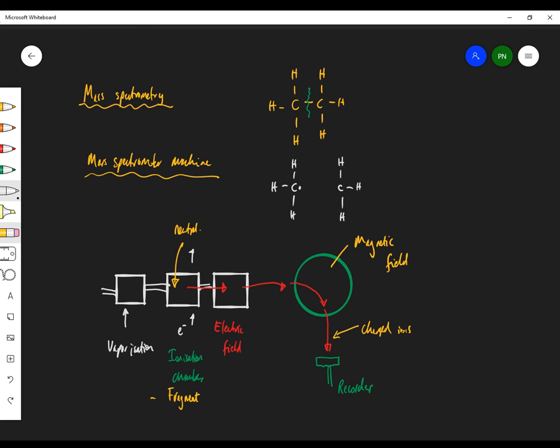Let's pretend there's an electron there and an electron there. So there's two radicals there. But don't forget, one of the radicals has been smashed apart by the electron, and so the electron on this radical will have been shot off. So this will be a positively charged thing. When you split something up, you end up with an ion and a free radical. The free radical is neutral, and it doesn't go into the machine, so the free radicals hang around this ionization chamber. Because they're not charged.